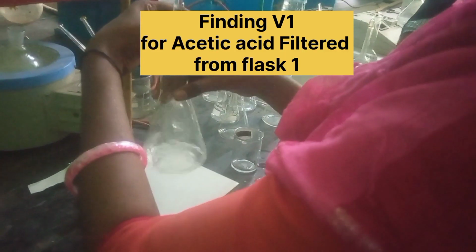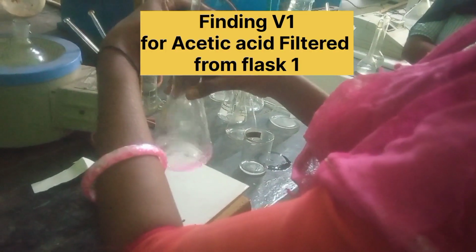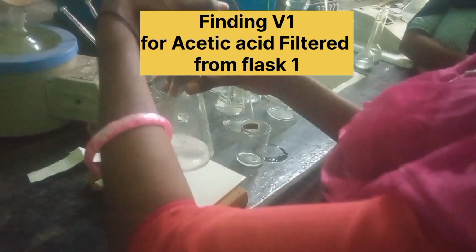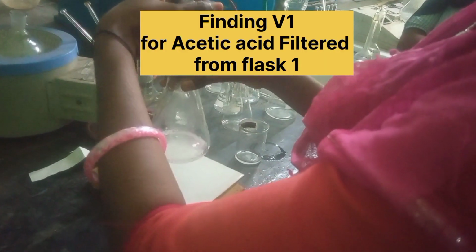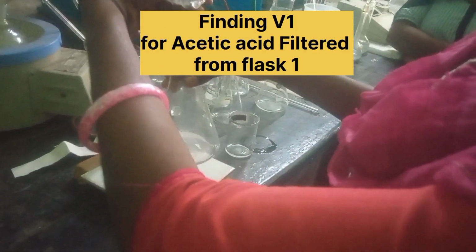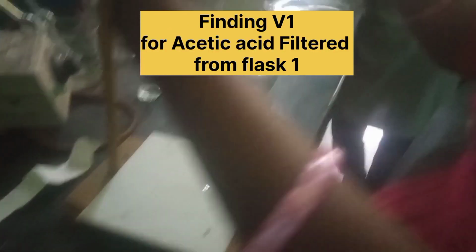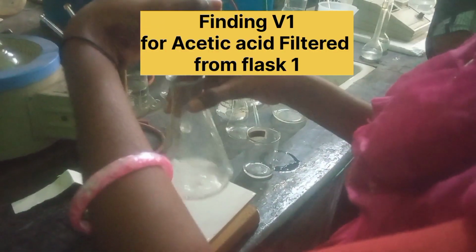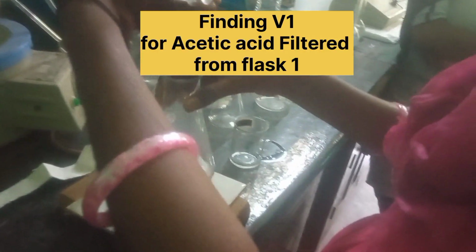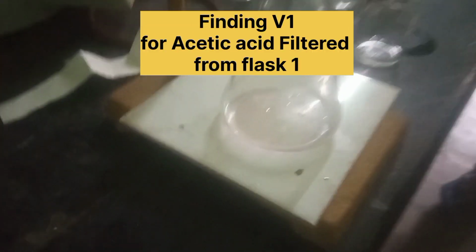The value obtained here is to be considered as V1. That means the volume of sodium hydroxide required to neutralize acetic acid taken from standard flask 1. This will give V1. Here the observation of color should be done in a careful manner. So now this is V1.